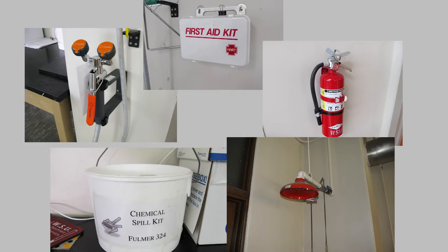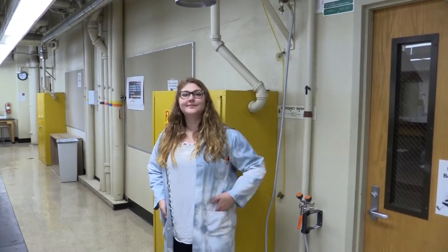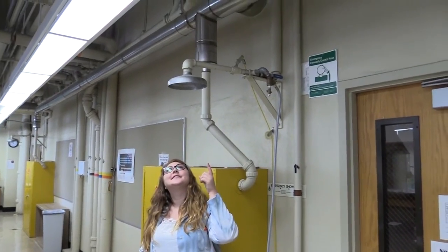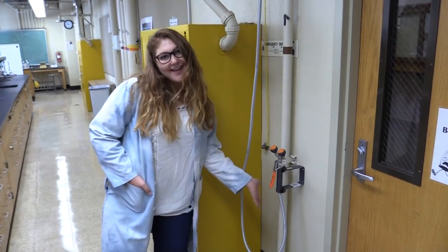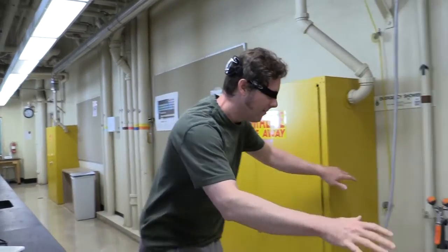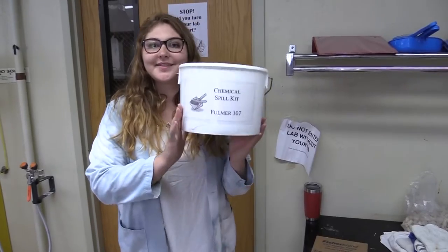No one wants to have an accident or become injured, but if you are, your lab room has plenty of equipment in it that can help you deal with it. First time you're in your lab room, please take a minute to memorize where certain things are. The fire extinguisher, the safety showers, eyewash stations. You are definitely going to want to know where these are ahead of time in case you need to find them when your vision is impaired. A first aid kit and a chemical spill kit.